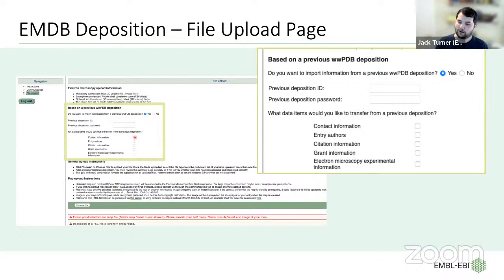If you actually want to pull across information from a previous publication's deposition that you did a year or 2 ago, due to the way the system currently works, and we're aware of this, but I'm going to tell you the workaround, it needs the pickle files under the hood to exist for the previous deposition. What this means in plain English is those get scrubbed after 12 months.